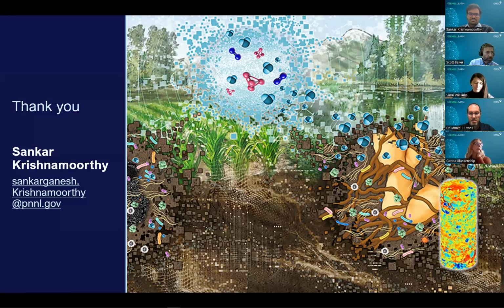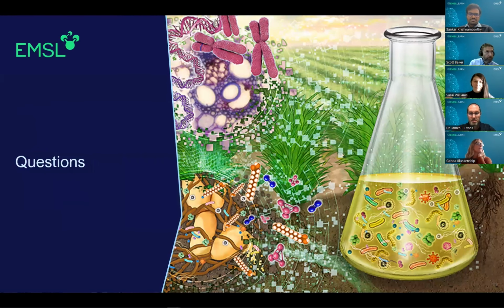Okay, Sarai, another question for you. In what capability can EMSL users be involved with the cell isolation in the nanoPOTs pipeline? It's a really good question. I think the answer to that has several parts and it depends on the experiment. Now, if you are interested in spatial proteomics, we have two options for you. Some facilities have their own cryosectioning and their own LCM. And so for users like that, we send our nano well chips to them, and then they sort the samples for us. They send them to me for processing.